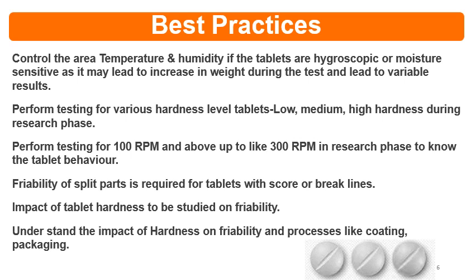Then impact of hardness to be studied on friability. What is the hardness of the tablet and how is the friability? That is required to be studied. Understand the impact of hardness on friability and on processes like coating and packaging.